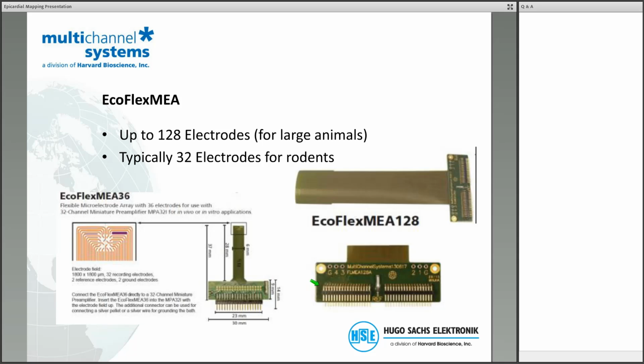I have to say that this one is not used for Langendorff experiments, but it is used for in vivo experiments on control animals and on animals that are modified to have a higher risk for a cardiac infarct, for coronary infarct. So that is something that is very close to clinical research, and we have several of these systems in larger hospitals all over Europe.